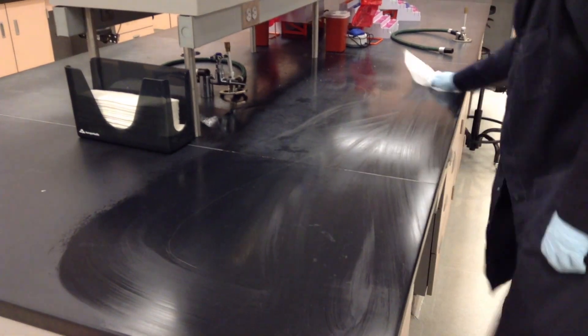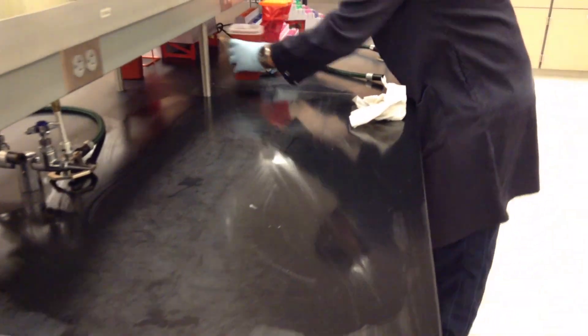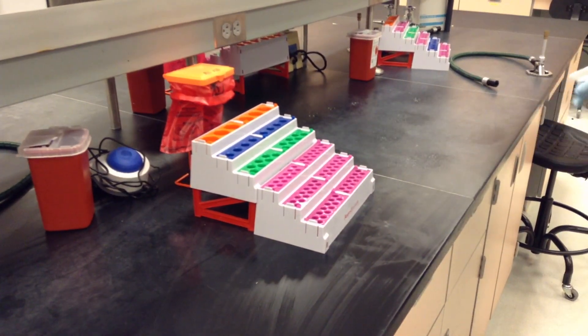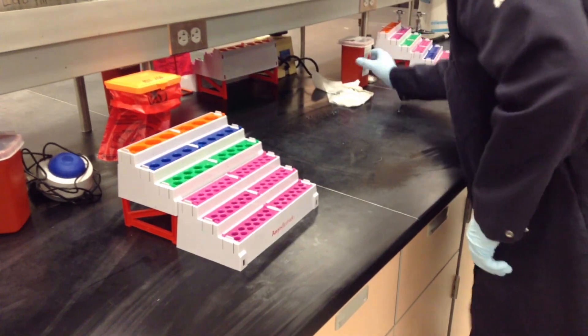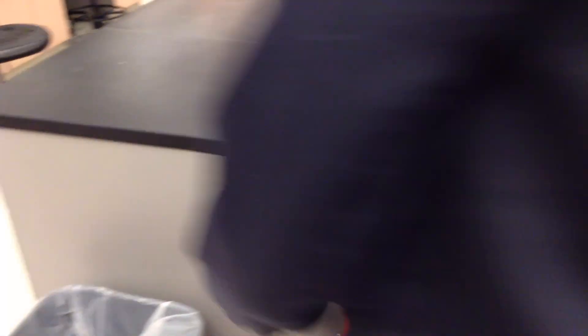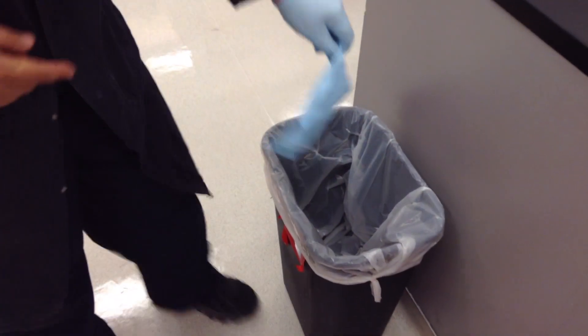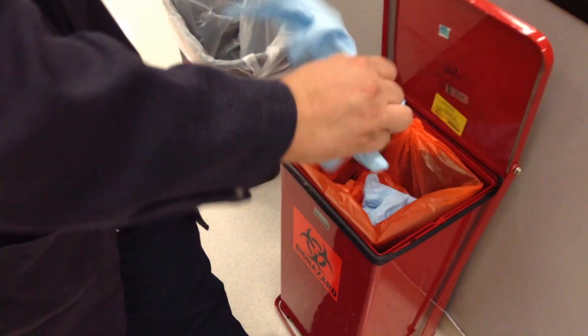Start at one end of the bench and thoroughly wipe down the bench. Make sure to also wipe down the area underneath the top shelf and make your way to the other end of your half of the bench. Remove any equipment in your way as necessary to thoroughly clean your bench top. Once done, throw away the paper towels in the regular trash bin and your gloves in the red biohazard container.